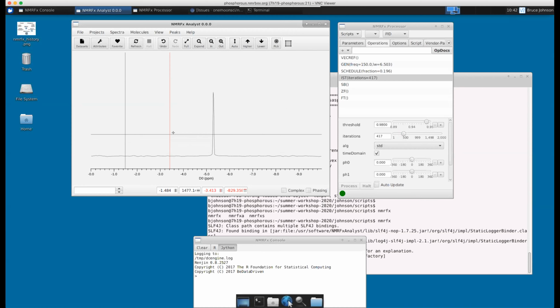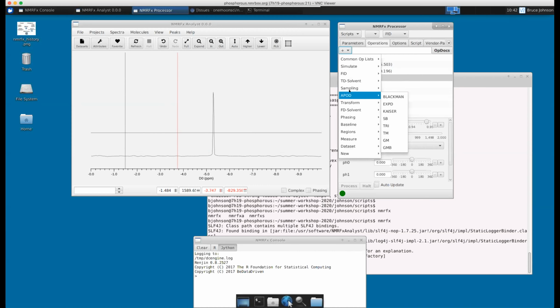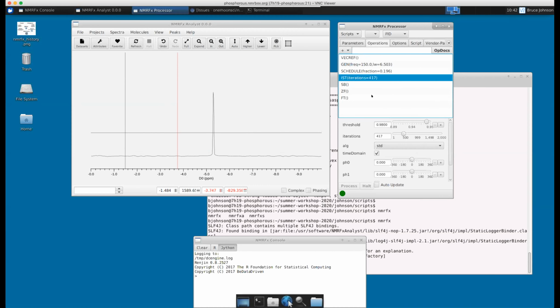Basically, instead of just chopping off the signal, we're finding peaks, fitting peaks and subtracting off entire peak signals, and doing that iteratively until there aren't any peaks left in the spectrum. Each time we find a peak, we use the inverse transform of that peak to repopulate our missing time domain data. That would work here, but I have a small bug: if I insert GRINS in the simulation mode, it seems to throw an error, but we'll use it on real data in a little bit.